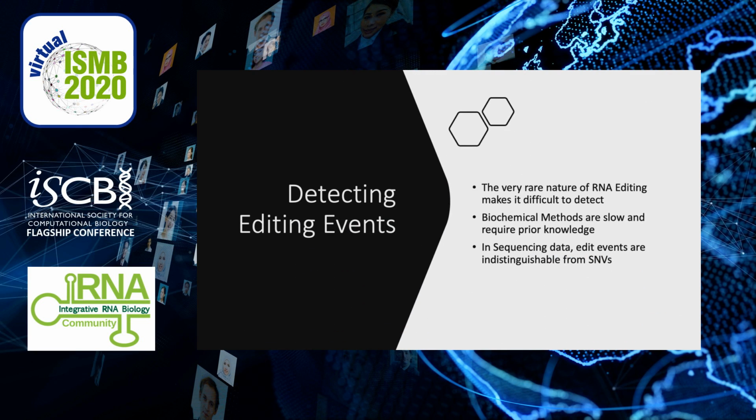However, characterizing the editome is a difficult process by its very nature. Editing is a rare event. The biochemical methods are slow and require sites to be known, and on sequencing, editing is indistinguishable from single nucleotide variants.